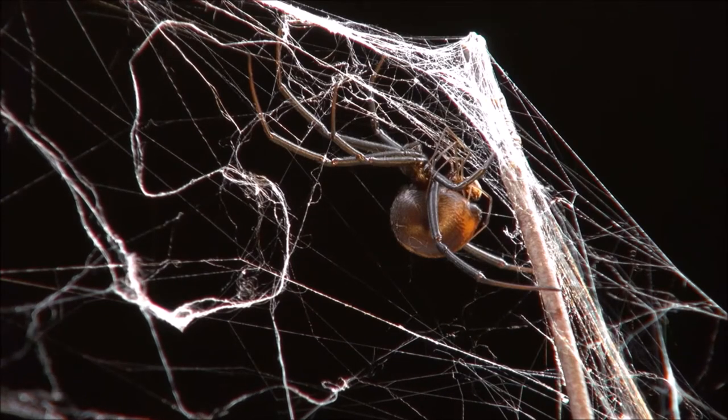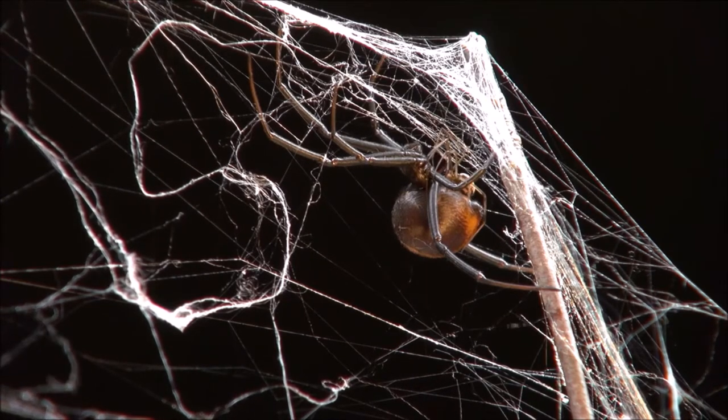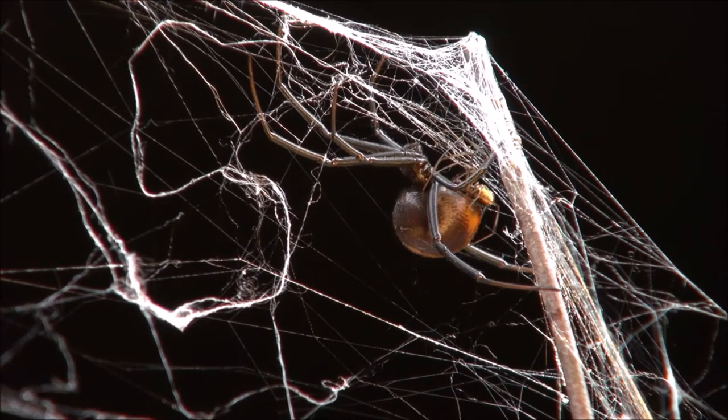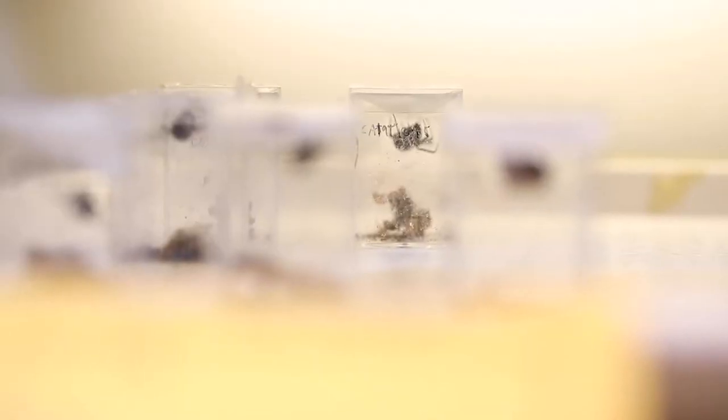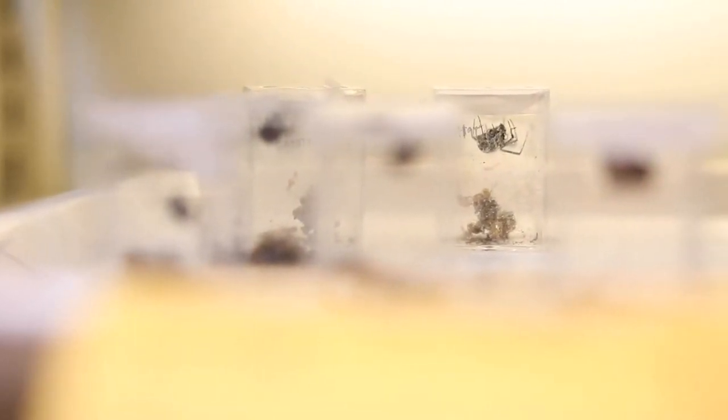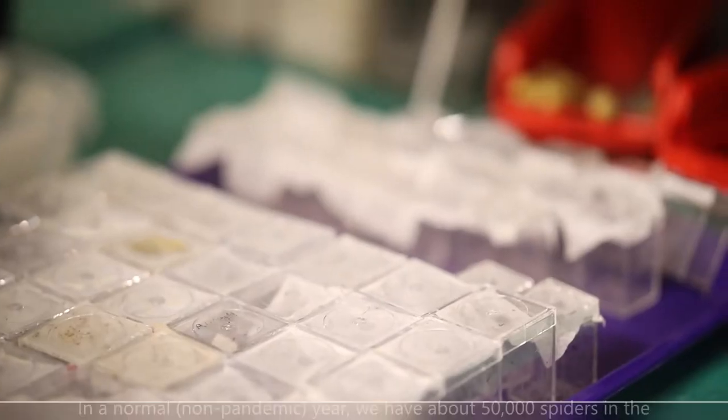But before we get to the stage where we can use them for our experiments, we have to rear them. Spiderlings are produced by the hundreds by females in little balls called egg sacks that they produce about once a month.